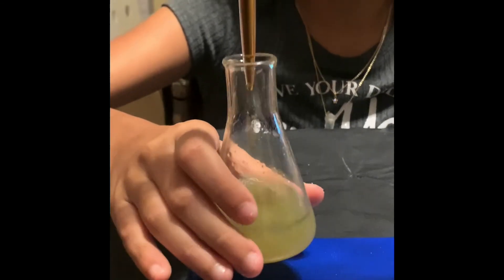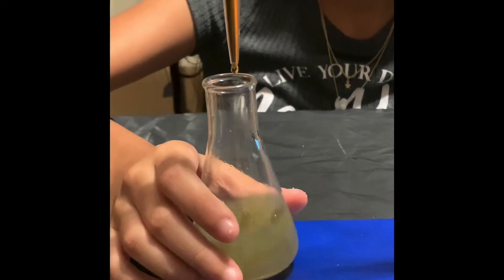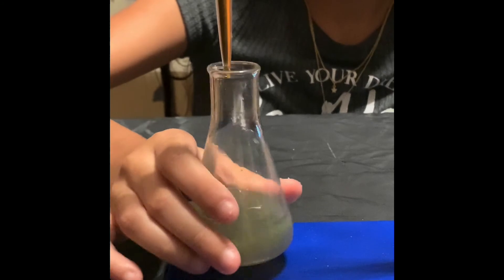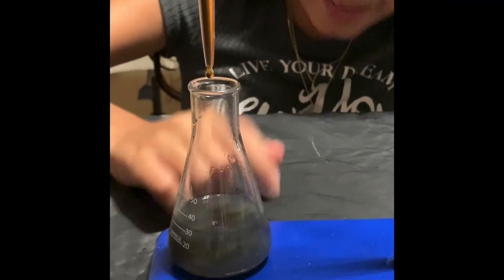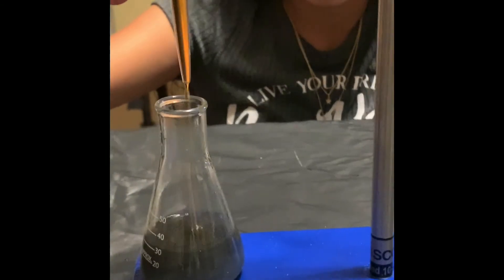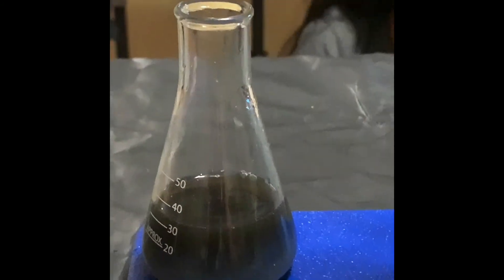It's turning darker by the second, but remember we need complete darkness. It's getting closer and closer. We are almost complete, just need a little tiny bit more. And now it is done. This is the color we need it to be for the titration process to be complete.